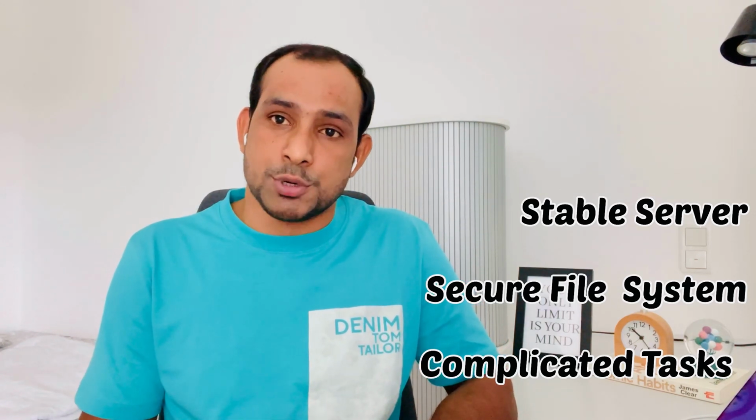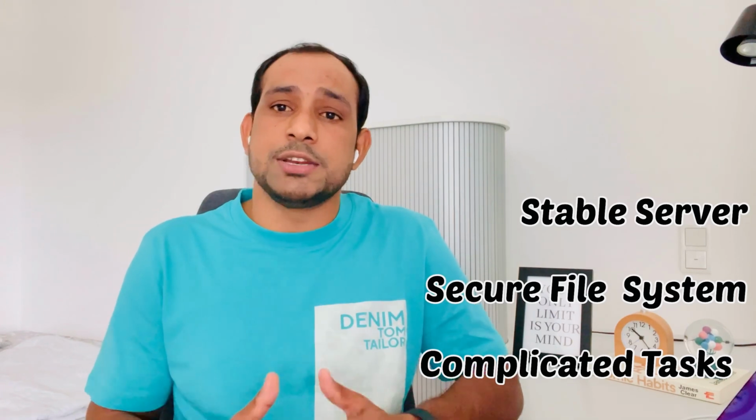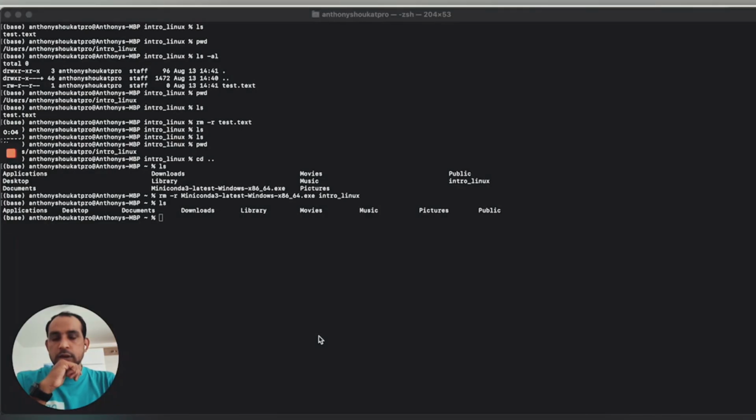Let's jump into the tutorial where I will explain you all the commands that you need to perform RNA sequencing data analysis based on command line pipeline. Welcome to the Linux introduction tutorial. In this tutorial, I will explain you all the commands that you need for RNA sequencing data analysis. After this video, I'm gonna make a video which will be on RNA sequencing data analysis. I will do all the data analysis steps on Linux command line terminal based pipeline.